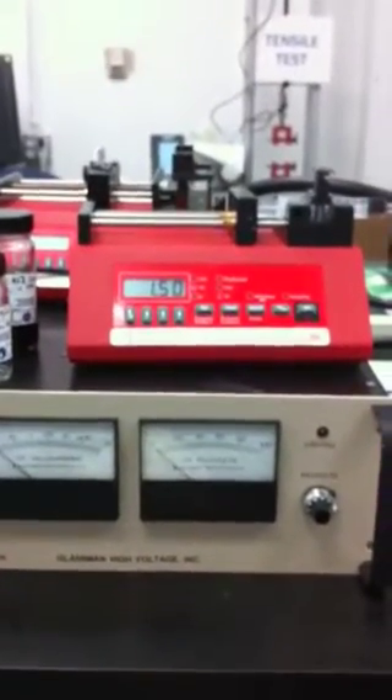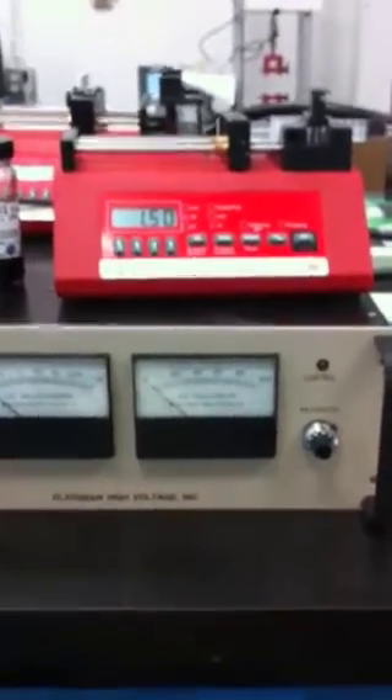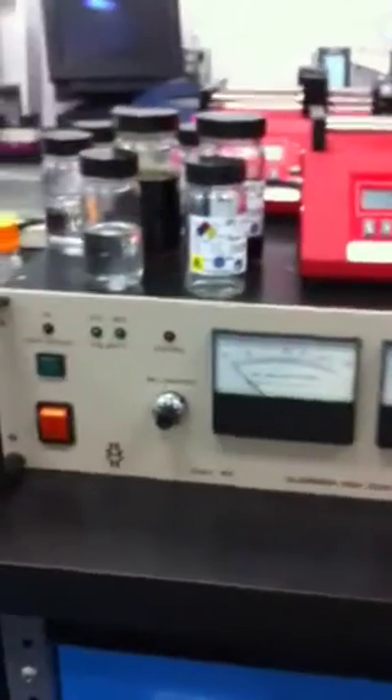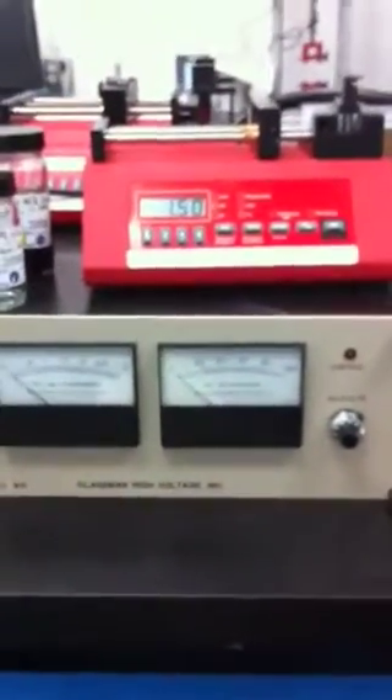Here we have our electrospinning setup at Paul Aero Power Corporation in Newport Richie, Florida. On the bottom of your screen you see a Glassman high voltage power supply. That power supply goes up to 100 kilovolts. We only use approximately 25 kilovolts at a time, possibly up to 30 depending on the application.